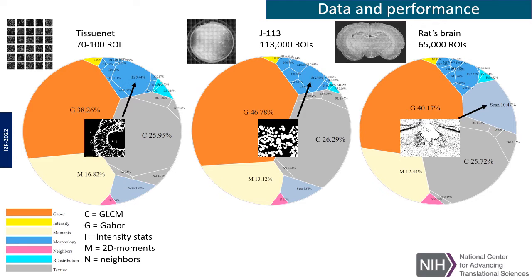So on the right hand side, the time breakdown is scanning some trivial segments and large segments that require following them one by one. Expectedly the scan is expanded up to 10% more. And finally, processing a large amount of simple shaped segments results in decreased morphology timing compared to the first case.